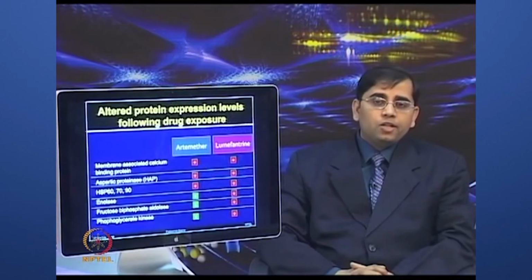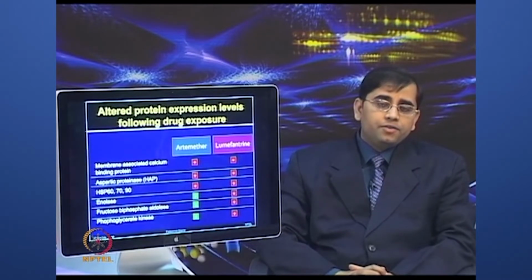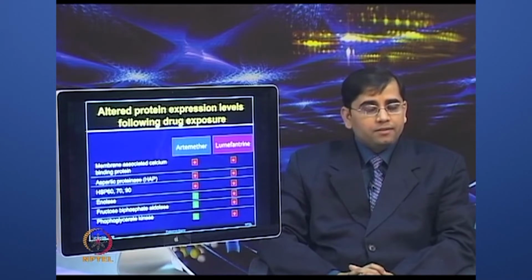So, the comparative analysis of 2D gels from untreated and drug treated parasite protein fractions provided direct and distinct alterations in parasite proteome following artemether or lumefantrine drugs.